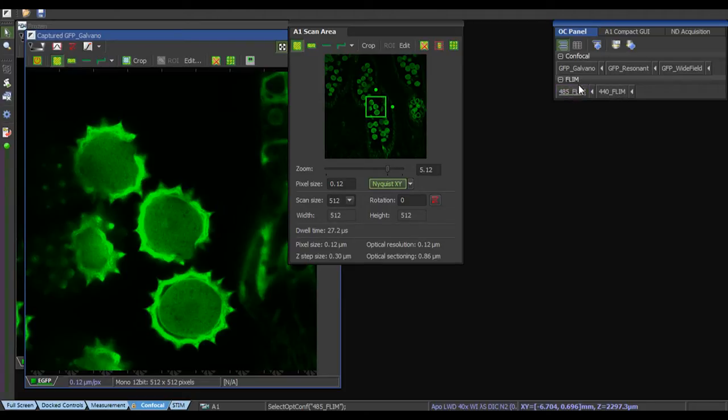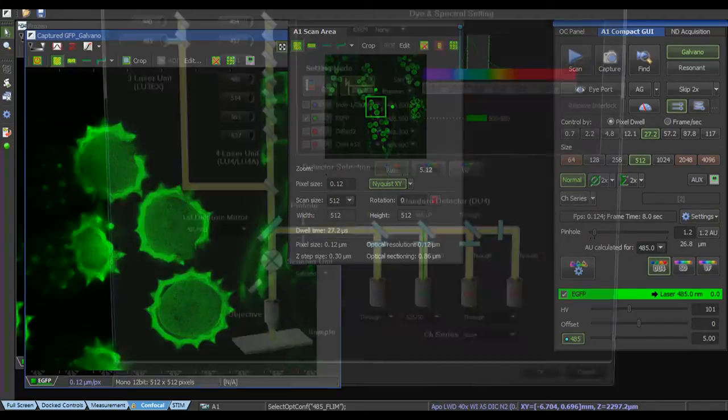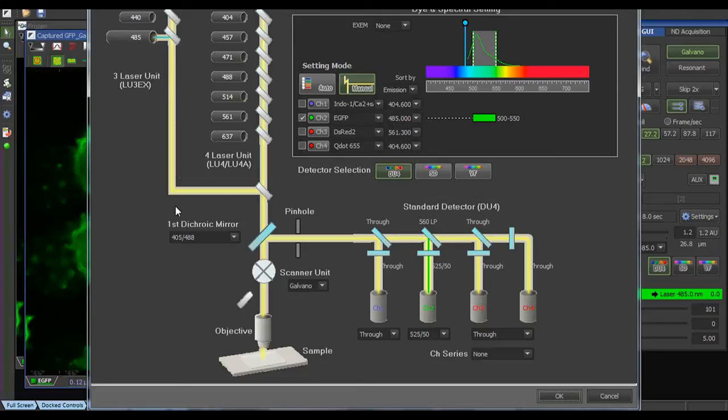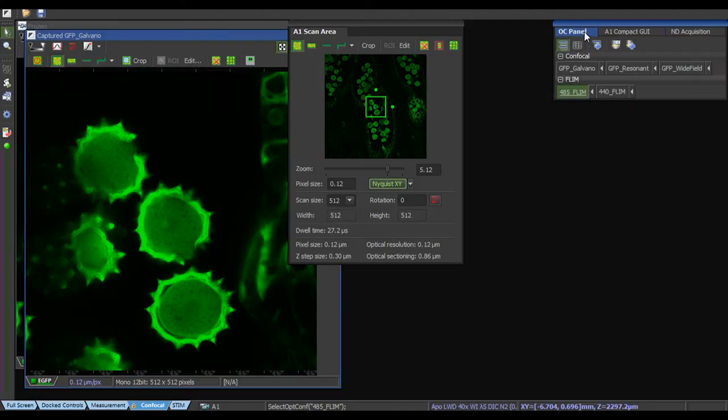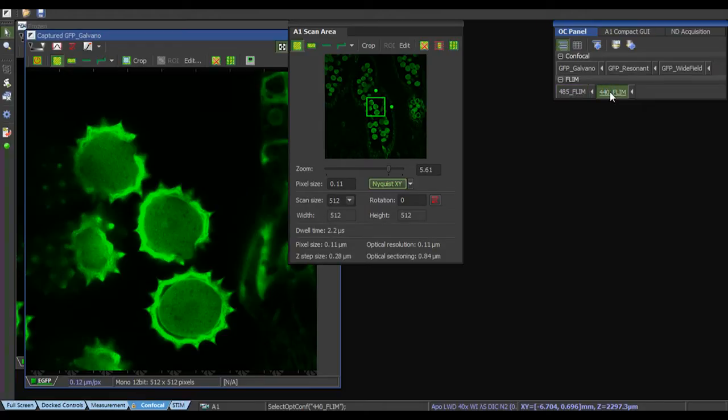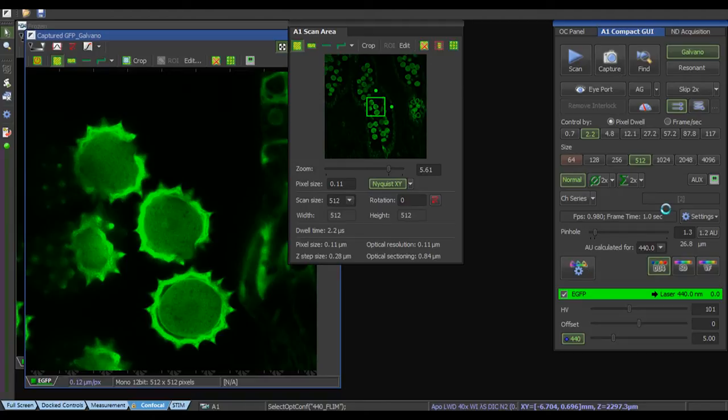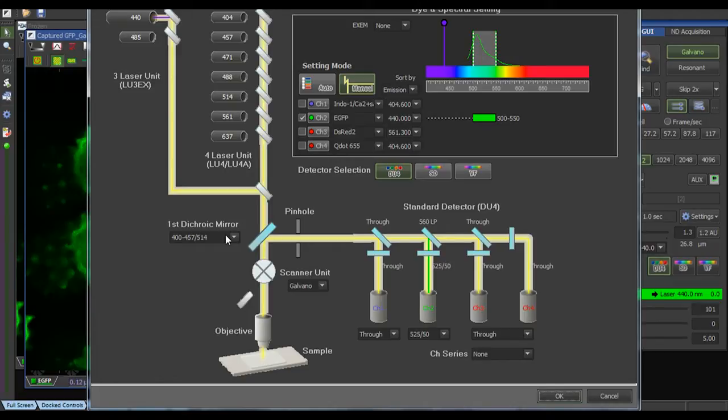If I open it and look at the optical diagram we see that in these settings we've got the PicoQuant pulsed laser here activated and also a dichroic which could match this spectral line. If we change the configuration for example for 440, then we will see that the 440 is activated and we also have a different dichroic that would match this laser. All these settings have to be previously configured in the NIST software.